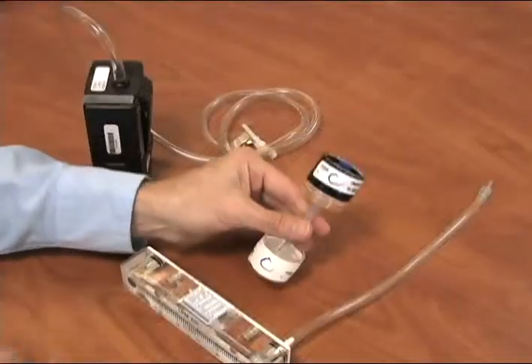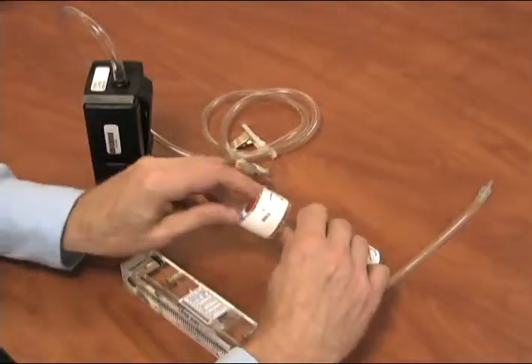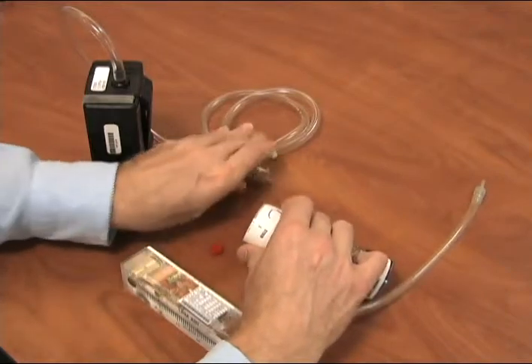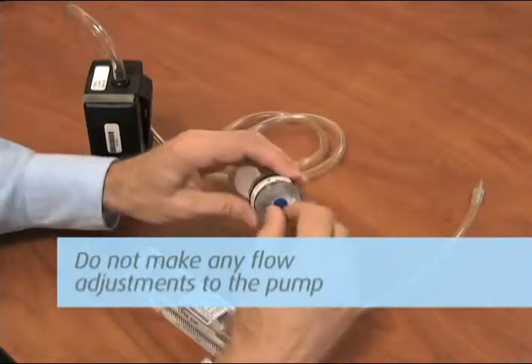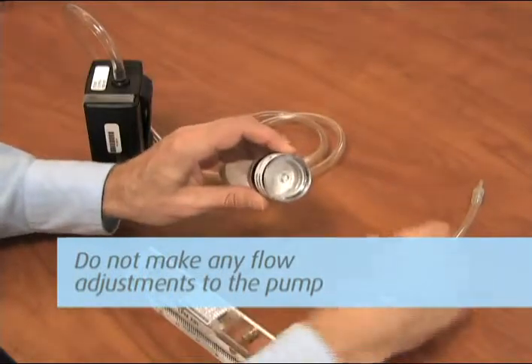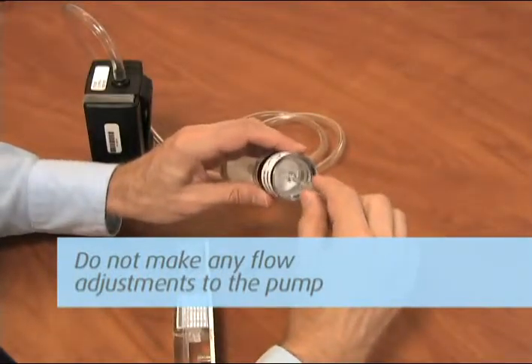After sampling is complete, perform the post-calibration the same way you did the pre-calibration using the marked calibration filter cassette assembly. Do not make any flow adjustments to the pump. Just record the flow rate on the pump calibration sheet.